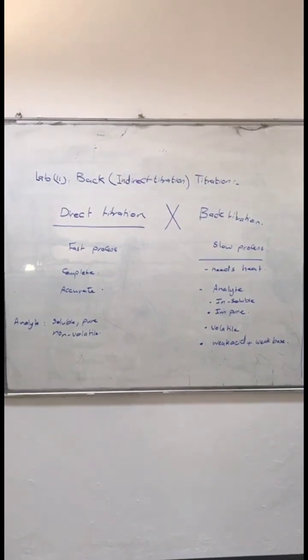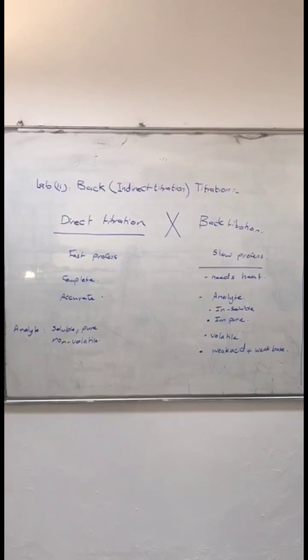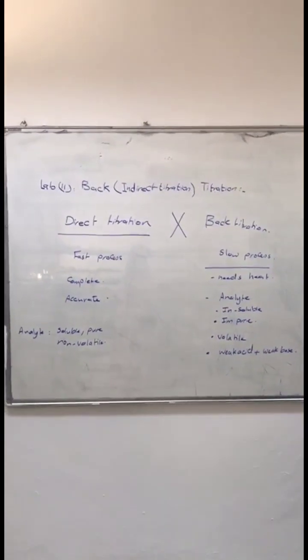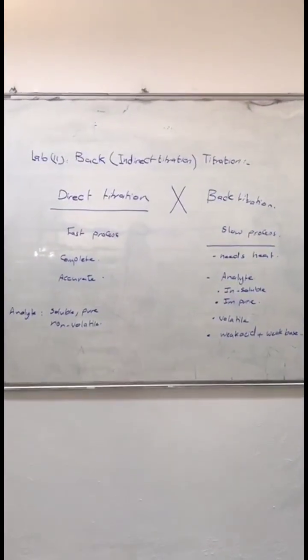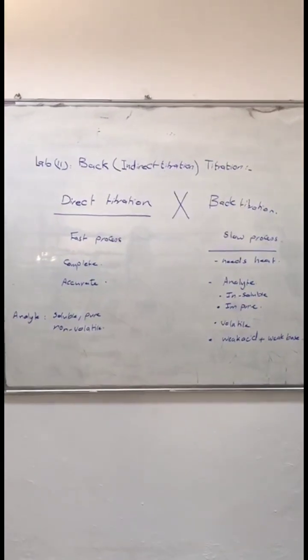Lab number 11, back or indirect titration. We have two kinds of titration: direct titration, as we studied before, and today we are going to deal with back titration.